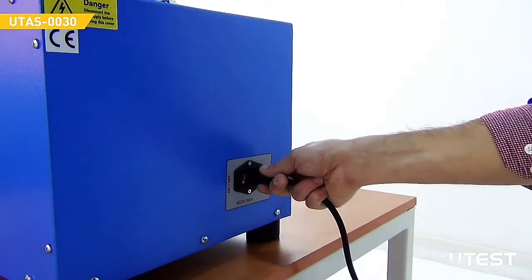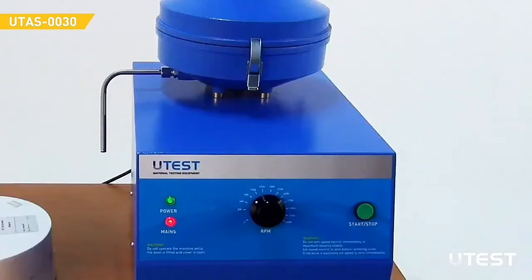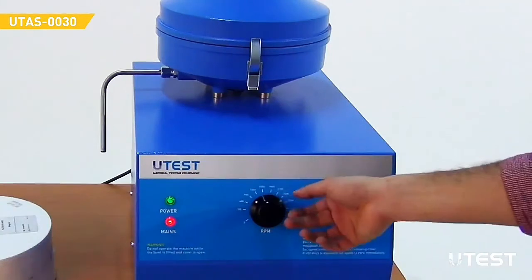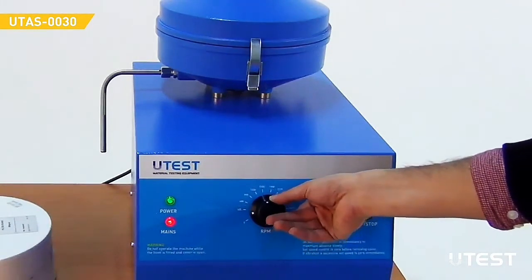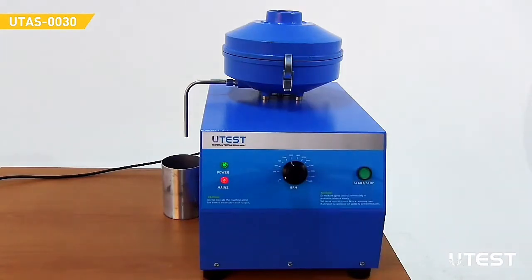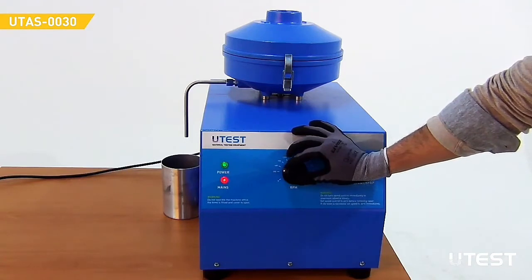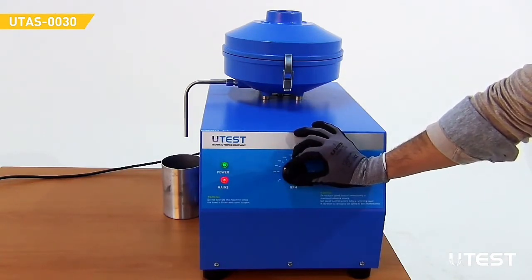Plug in the power cable and turn the device on using the power button. Make sure that the control knob is in the leftmost position before pressing the start button. Press the start-stop button. Start the centrifuge operation by gradually turning the control knob clockwise. Do not suddenly increase the speed of the device.